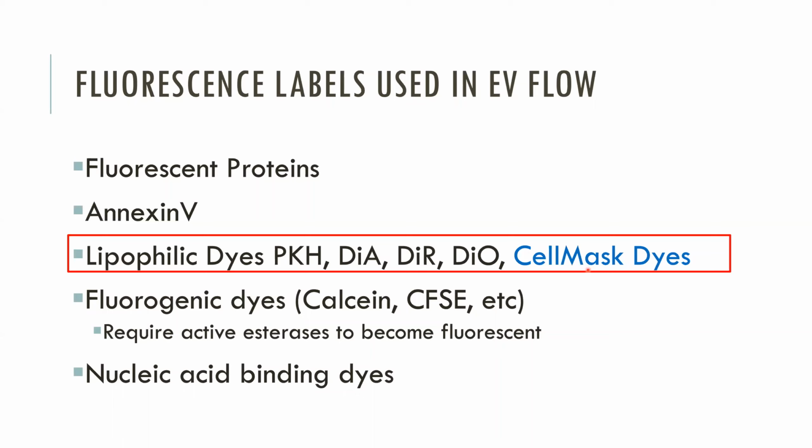And the work that I'll show you today are CellMask dyes from Thermo. We felt like that formulation really didn't form a lot of particles, whereas like PKH, you could see a lot if you just looked at dye in PBS.